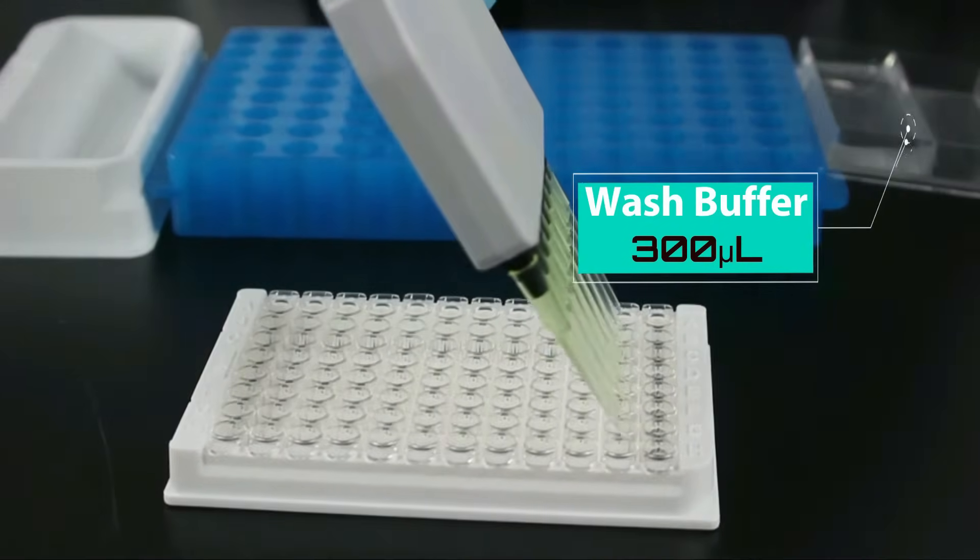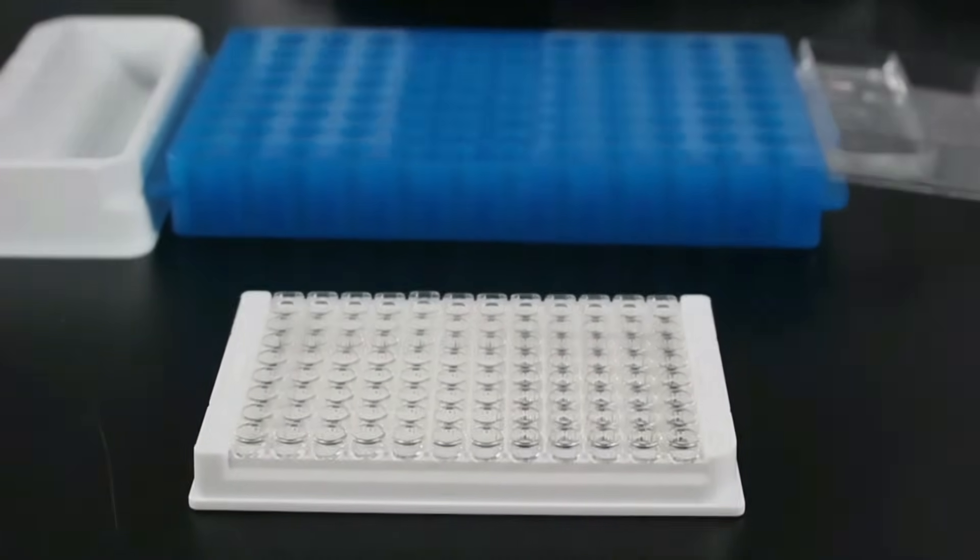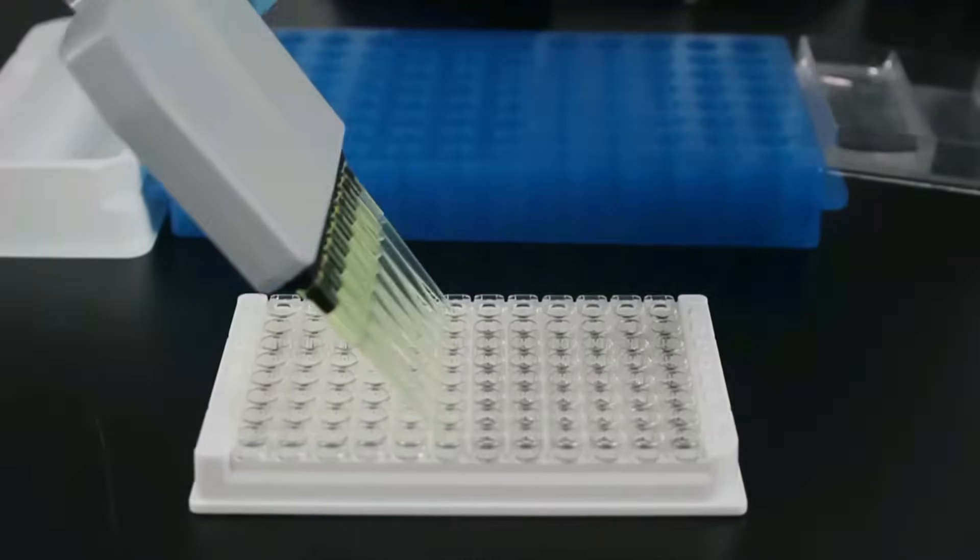Pipette washing is completed by adding 300 microliters of wash buffer to each well. With either wash technique, make sure you remove the excess liquid thoroughly.